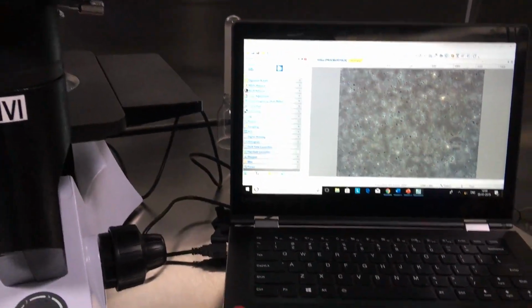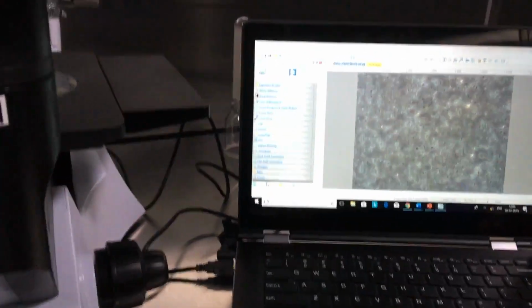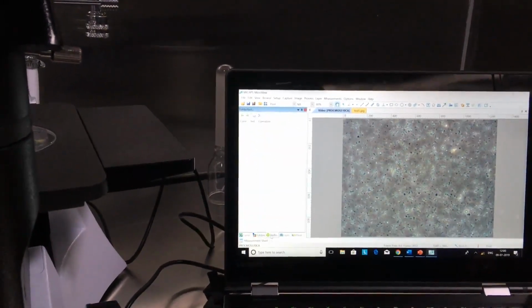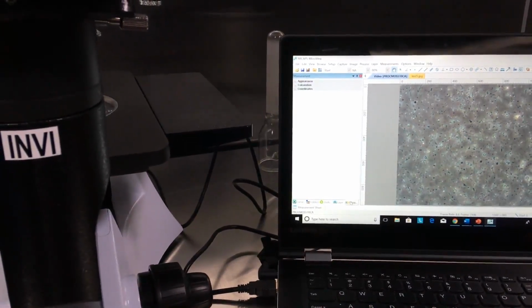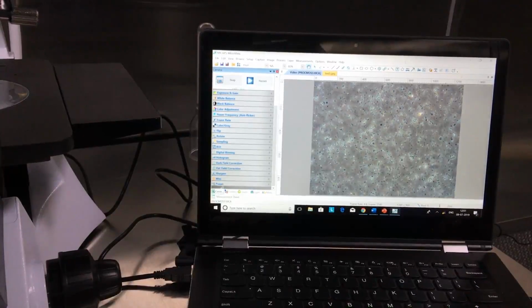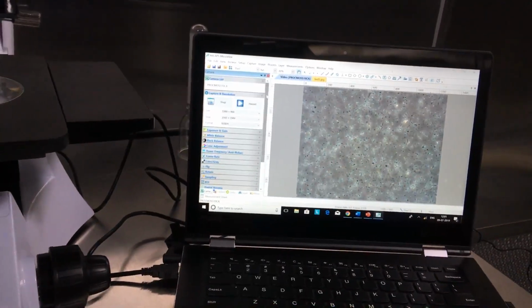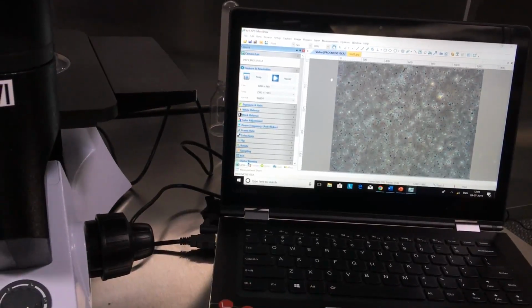So there are other options also. This is completely in the camera window. So there are the folders window, the undo redo window, the layer window, the message window, the measurement window. So ours is the camera window. Here are a lot of options. So we have already done the snapping, capturing. Then we'll go for recording.